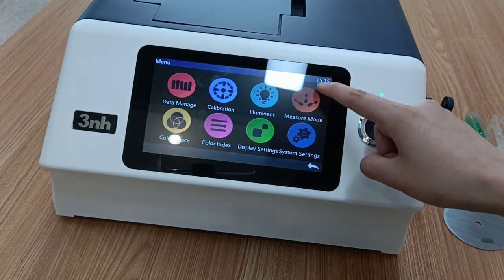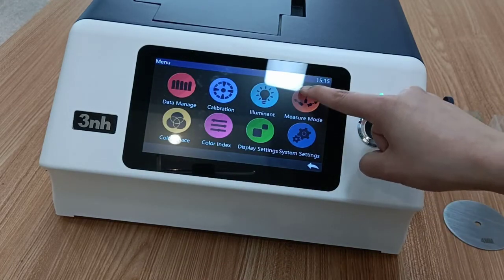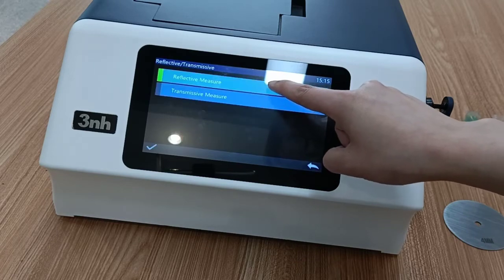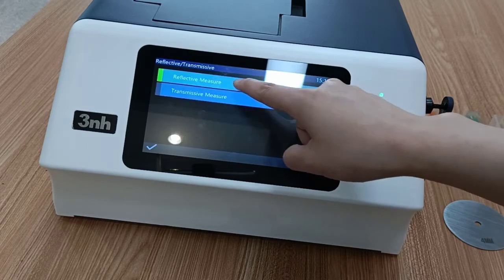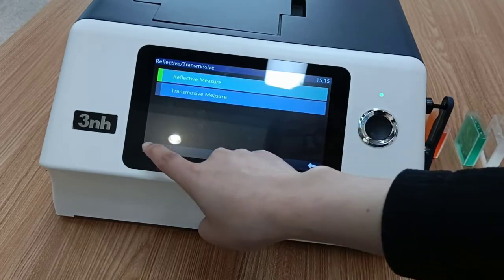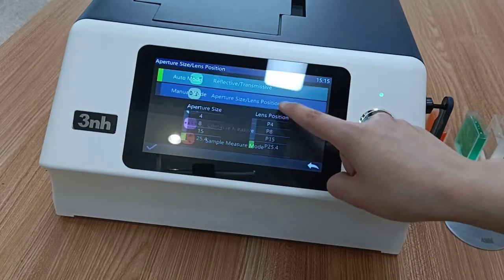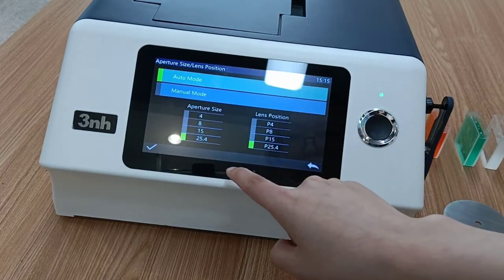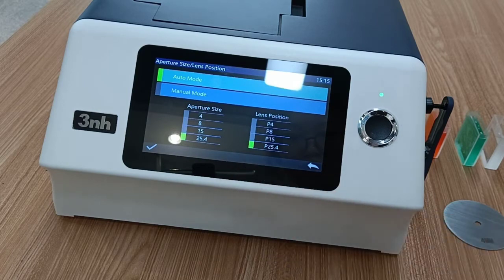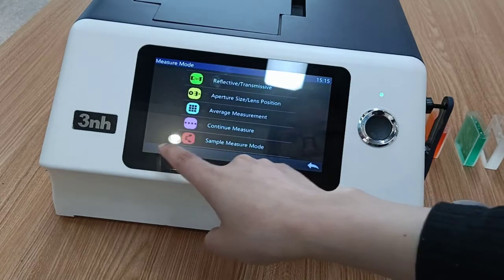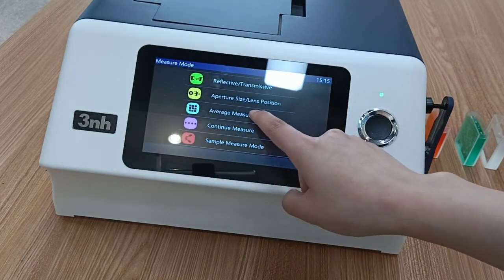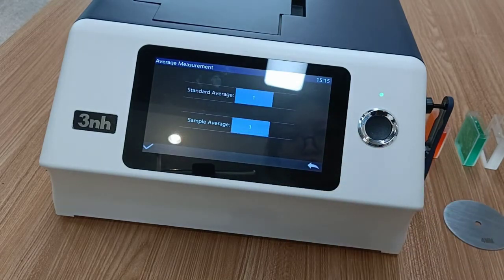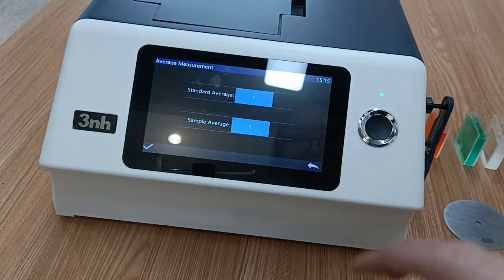Then we need to select the measure mode. First we set the reflective measure. Select the aperture that you need. If you need average measurement, you can set it here.